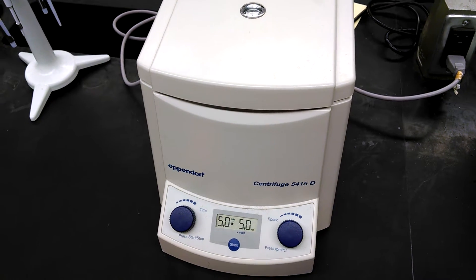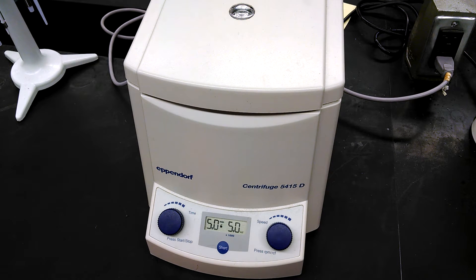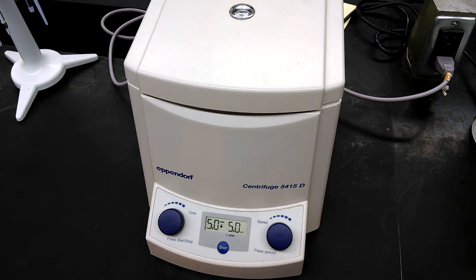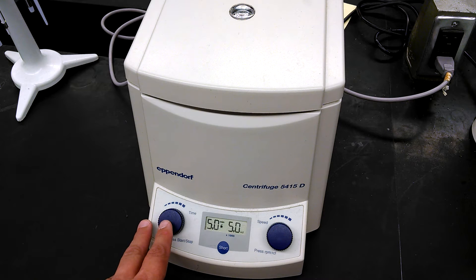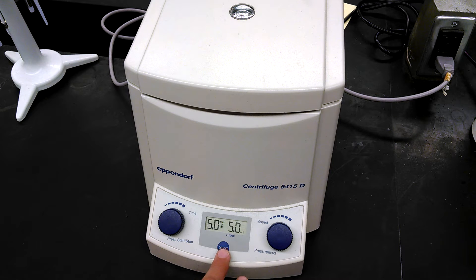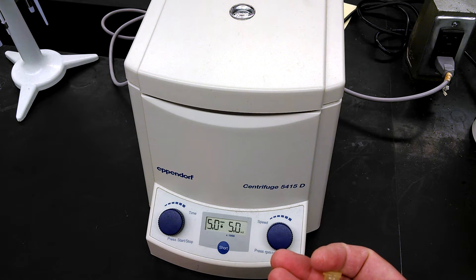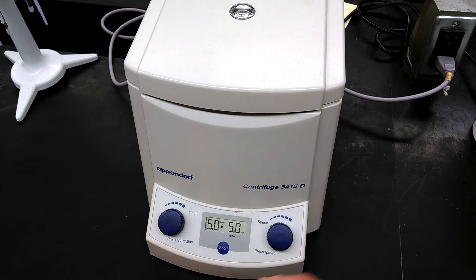When you're using a centrifuge, here's how you set the settings. It tells you to spin the samples for five minutes at 5,000 times gravity. And so our centrifuges all pretty much look the same. They have two knobs. One controls the time, and one controls the speed. They also have a third little button for very short spins. If you just hold this button right here down, it'll spin for as long as you hold it down, and it'll stop spinning when you release the button. So if you only want to spin it for five, ten seconds to pull liquid on the side of the tube down, you can pull it down using that button. It's very useful.